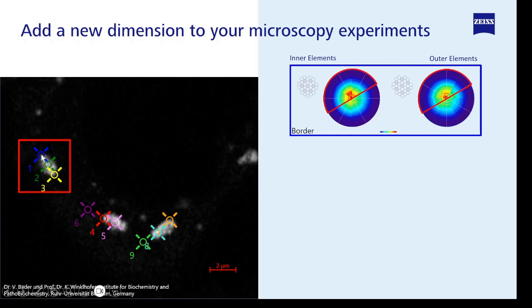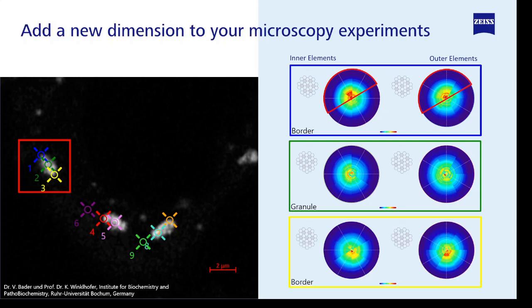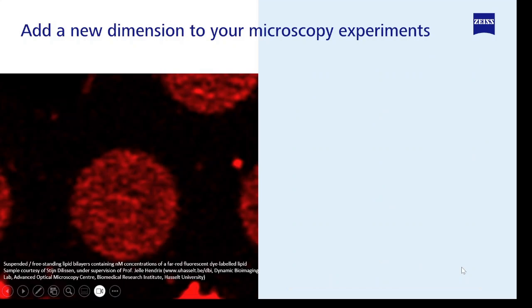From this border, we can see along these axes, the molecules behave with slower diffusion compared with the other directions. But in the center of the stress granules, the molecules behave as if they have a uniform diffusion speed. On the other border, it shows the same pattern.